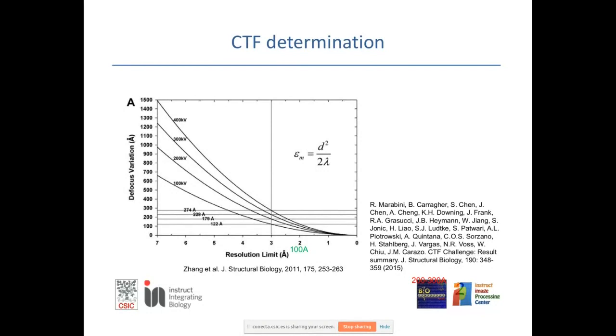Polishing is a kind of a cure to that, but it doesn't mean that all algorithms are estimating parameters perfectly. They try to do their best, but it doesn't mean that they will succeed. So polishing is a kind of poor man's solution. If you could have perfect data from the very beginning, you would be in a much better situation.